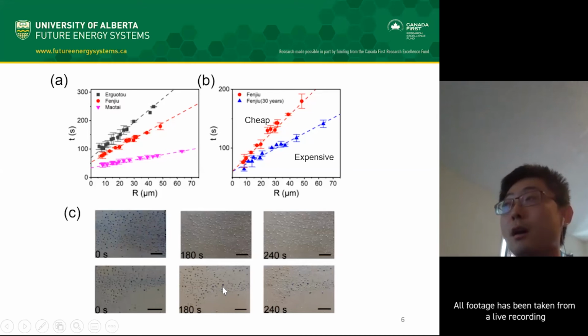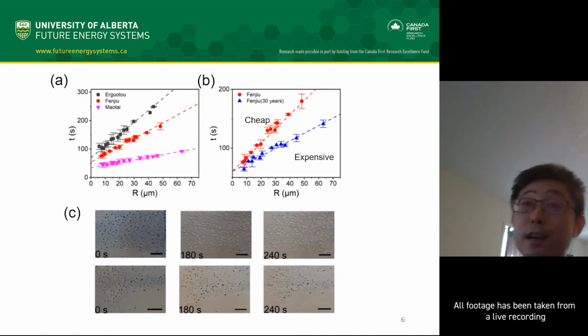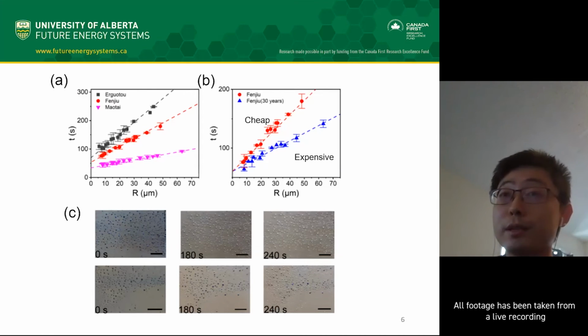Because our method can form different sizes of droplets and they can be controlled, we can form some very large droplets that can even be captured by a normal smartphone camera. So we can also achieve an instrument-free method for this detection.